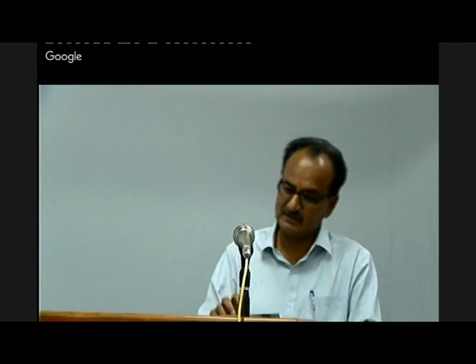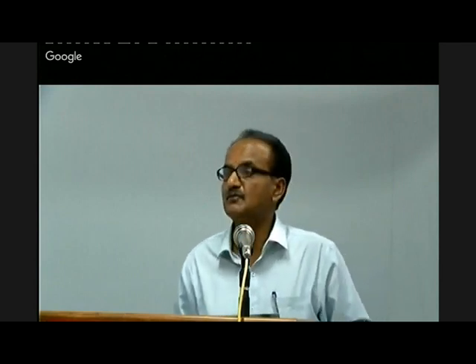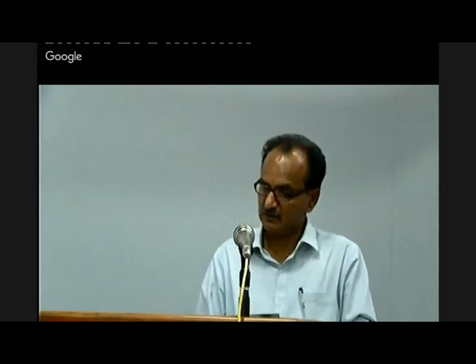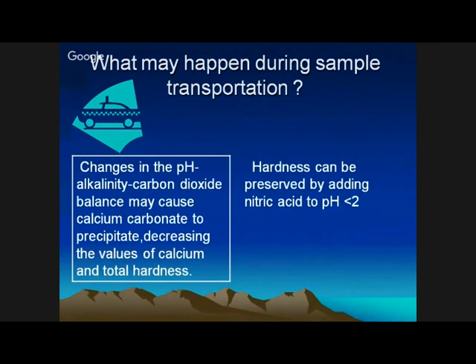While you are collecting, if you want to analyze the sample for these parameters, you have to acidify that sample to pH below 2. Similarly, hardness is another parameter. Hardness can again be preserved by adding HNO3 to pH below 2.